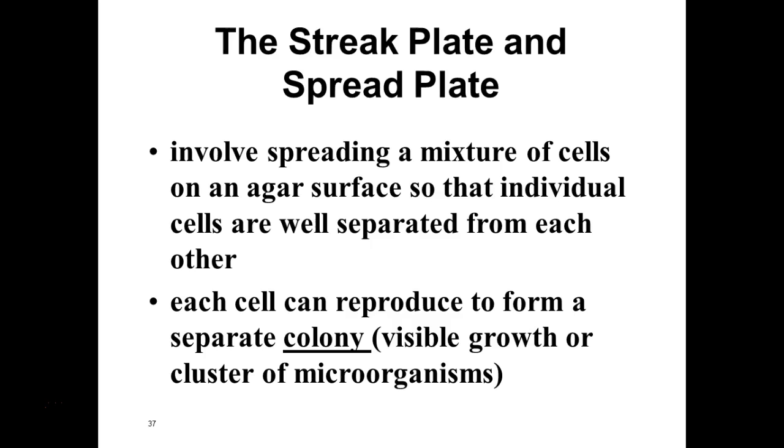So a colony is a physical growth that you can see on a solid culture media, typically a plate like a petri dish. And that growth is only pure if it arose from a single cell or cells of the same species. When you look at colonies on plates, there's no guarantee that it is in fact pure unless you do additional testing.